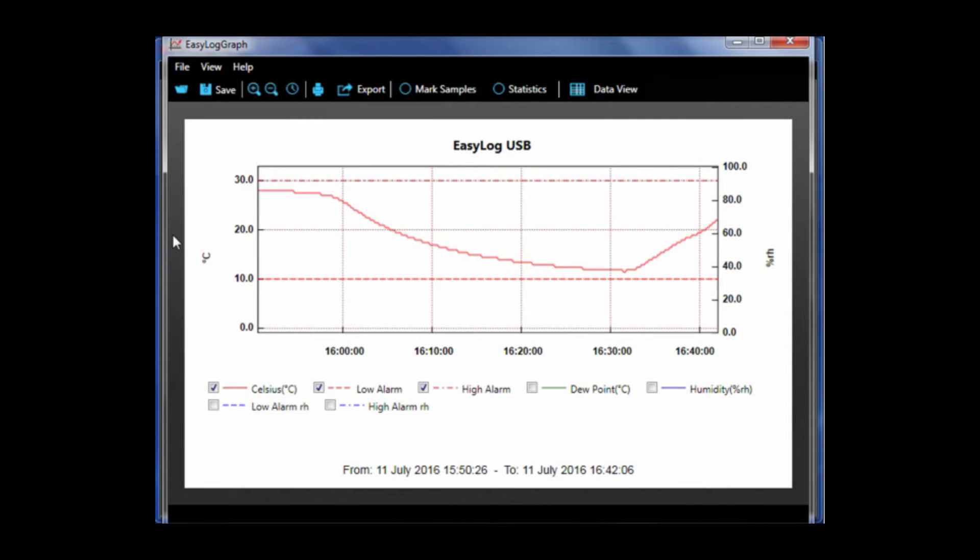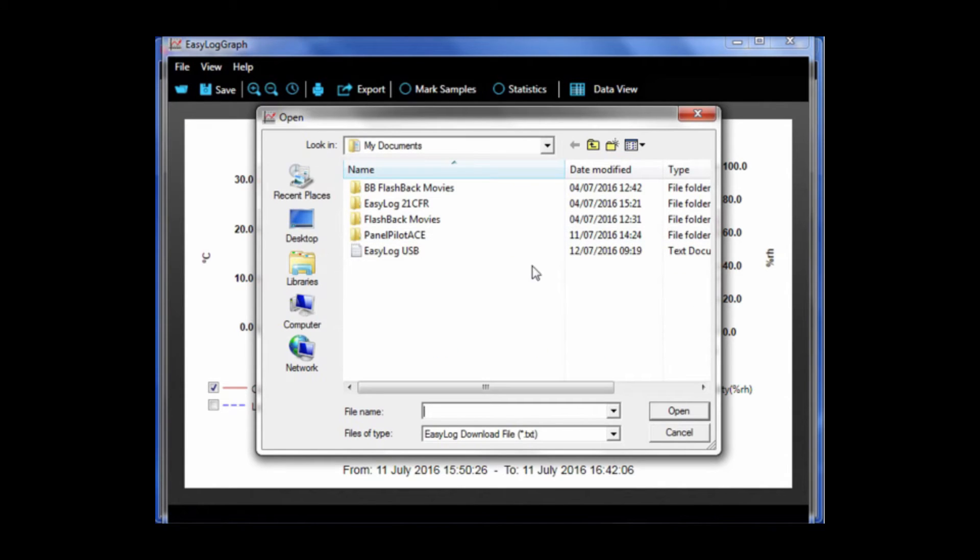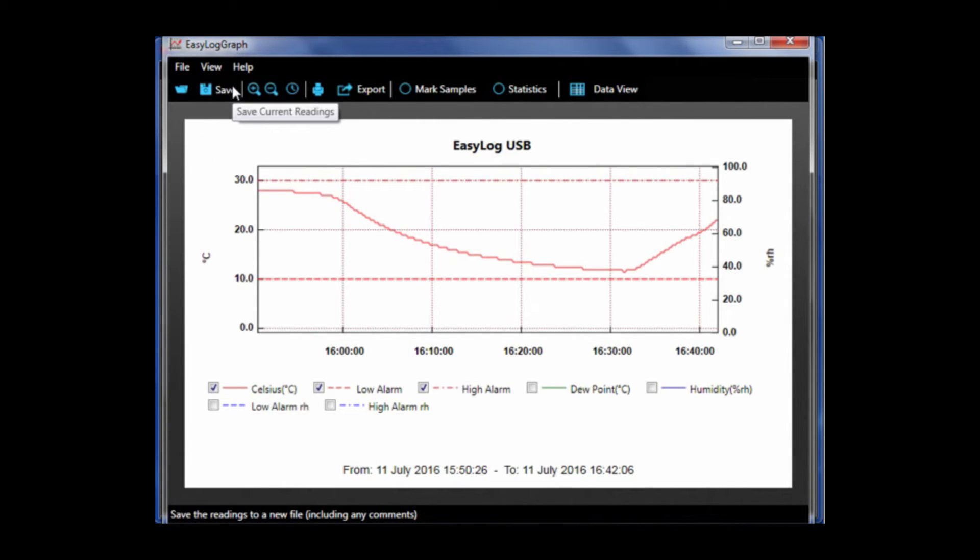At the top of the page you have a variety of options. On the far left corner there is a folder image. When you click it, it allows you to open a graph from a file. To the right is a save option which will save the readings to a new file including any comments.